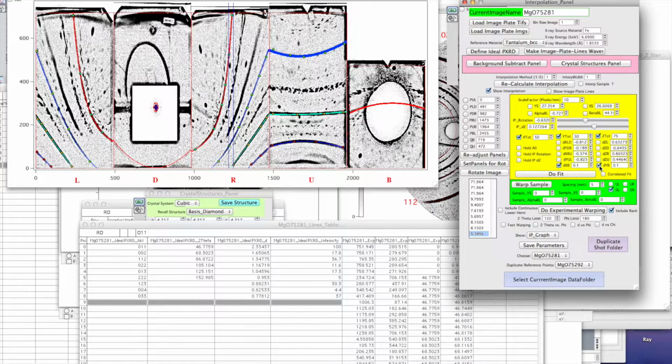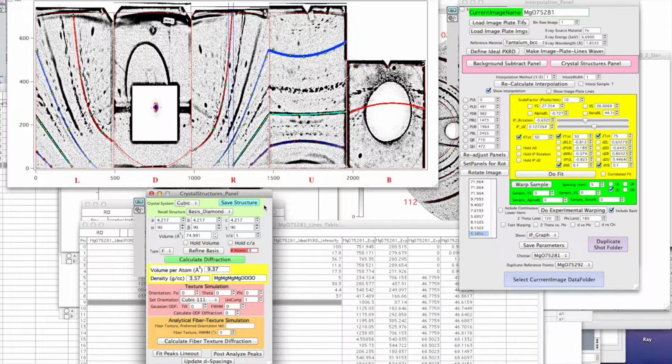All right. So it's just a case really of going through all of them. Okay. So if this was B. Okay, so let's go back to this. I can see how there's a lot of different options for the different lines, whether it's tantalum or ambient MgO, and then the helium alpha, helium beta, and you just have to basically go through them all, right? Yeah, and also the helium alpha is not perfectly monochromatic, so you should test out.